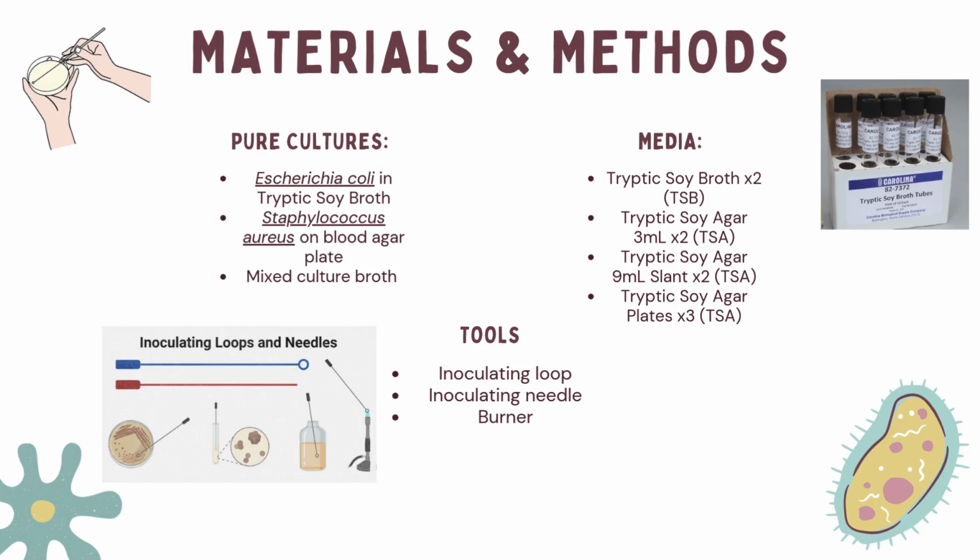The media included broth to observe turbidity and general growth, the slants to see surface growth, the deeps to test oxygen tolerance and motility, and the plates for colony isolation and morphology.